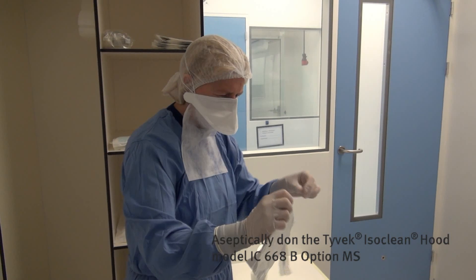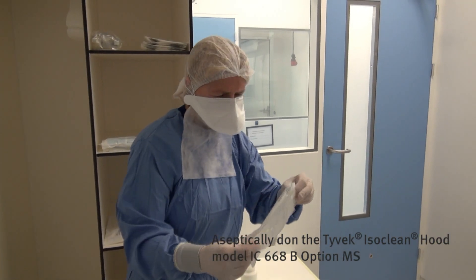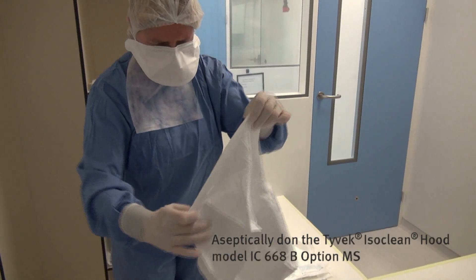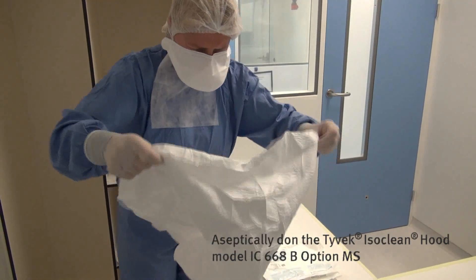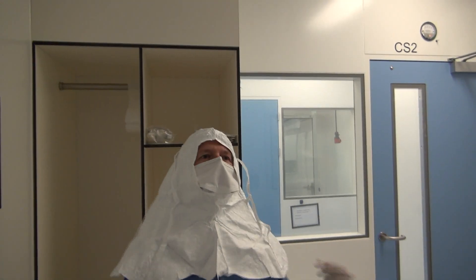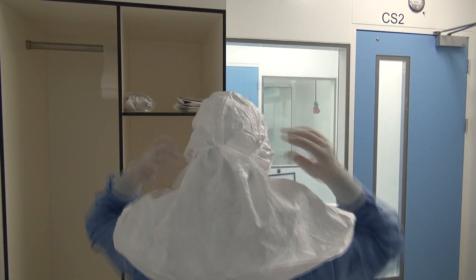Aseptically don the hood. Carefully unpack the Tyvek ISOClean hood and unfold it gently. After donning the hood, disinfect your gloves.